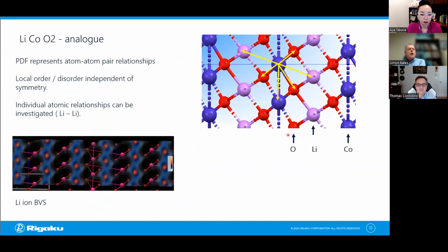Yeah, sure. So bond valence calculations, as you can see on the bottom left-hand corner, allow us to look at novel battery materials. As you're designing new materials, you start to get the structure, the average structure, the crystallography structure. We can then predict how free the lithium is to move through that structure, or how effective it will be as a cathode material, in fact, or as a solid electrolyte. You need to get mobility of lithium through that structure. So you're going to need to have layers or channels or pipes or something. And the BVS calculation allows us to do that given a crystal structure.